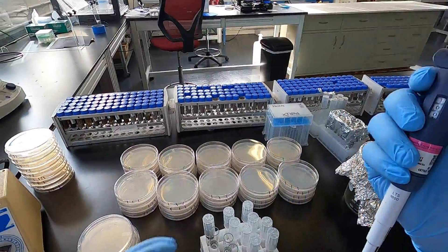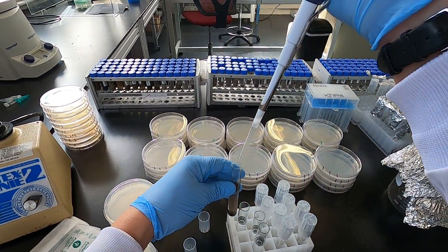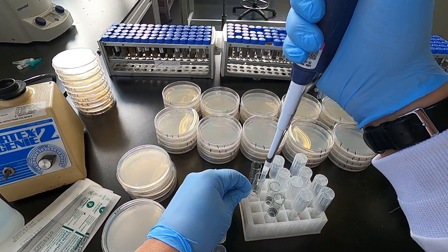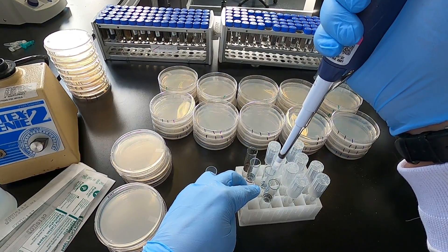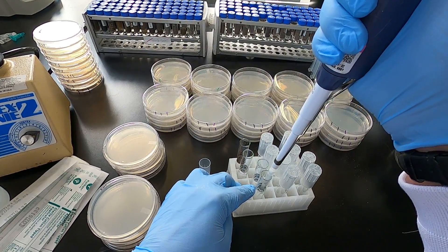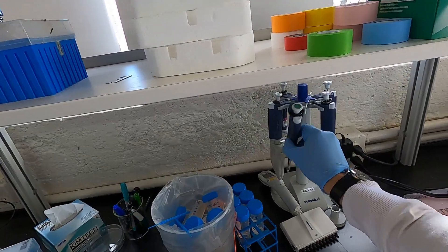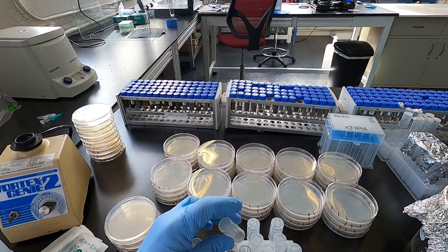Take our P-1000, set to one mil, and do our 1-to-10 dilutions. We'll go below the dirt to the middle and pipette. Pipette up and down in our next dilution to mix. Then it's easy to get your P-100s. You can set your soil samples aside.